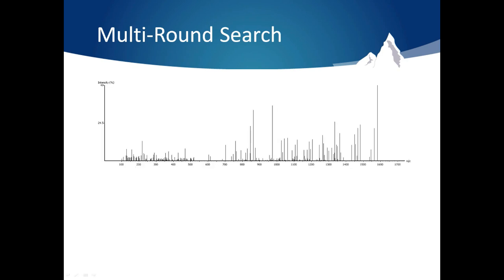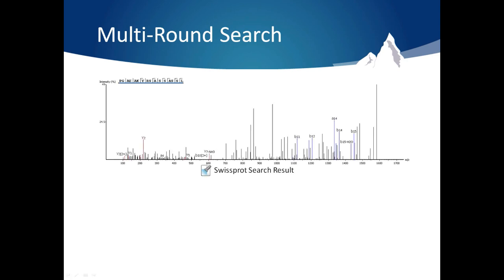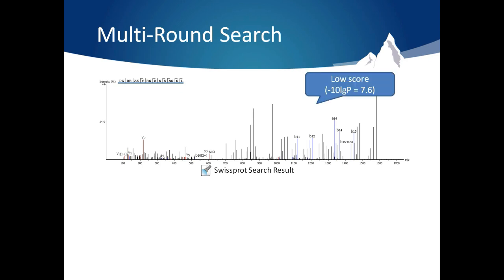For example, take this spectrum from a human antibody sample. Searching it against SwissProt, we are able to identify a peptide sequence, but not very confidently. The peptide does not come from an antibody protein. It is a poor peptide spectra match, and it has a low score below our 1% false discovery threshold.